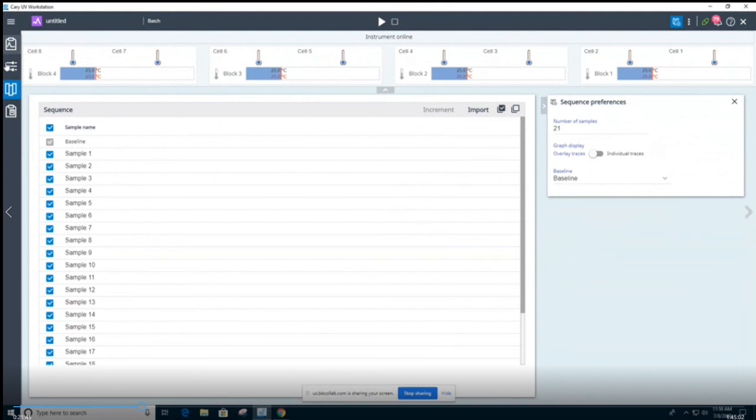might choose to put 14, which means if it took the first 7 and it was baseline, I could just have the next 7 be the sample. And if that happens twice, I could do it a third time. So I sort of arbitrarily chose to put 21, I give myself 2 chances to get this right. So that's the basic idea behind that. It's kind of a workaround for this kind of cumbersome and not very good software, because the instrument is wonderful, but the software, we're kind of the guinea pigs on that.